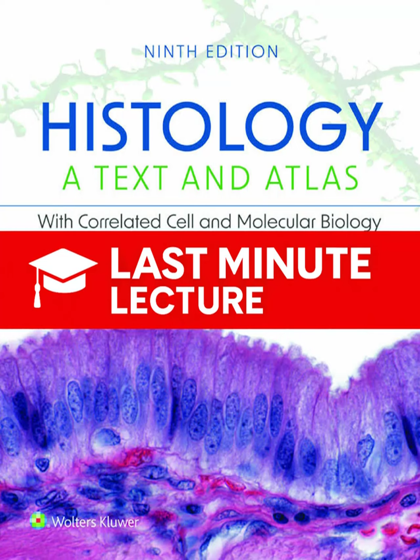And that block can finally be sliced. Right, on a machine called a microtome, which uses a very, very sharp steel knife. The sections that come off are amazingly thin, typically only 5 to 15 micrometers thick. Just to put that in perspective, a micrometer is 1/1000th of a millimeter. It's tiny. Then those thin sections get mounted permanently on glass slides using an adhesive like Canada Balsam or Permount.